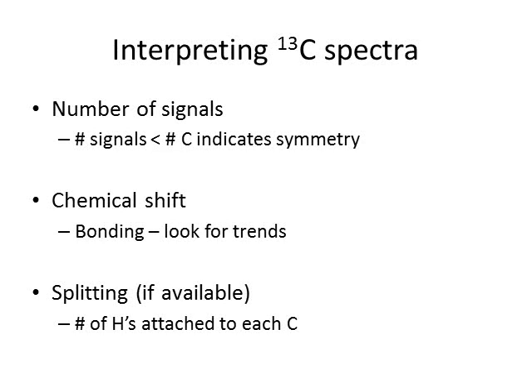And that energy is affected by what's called the local field. That is the effect of the electrons around that nucleus. Any carbon that has a different arrangement of electrons will have a different energy for that transition, and therefore, you will see different lines.